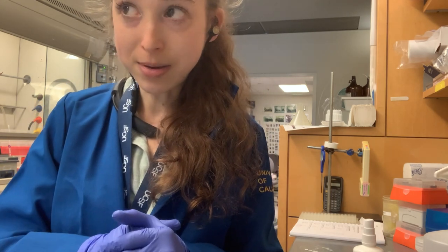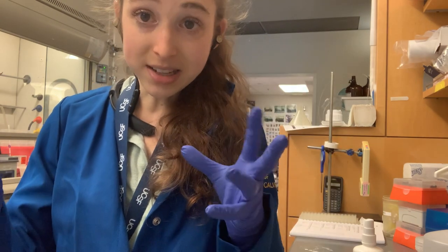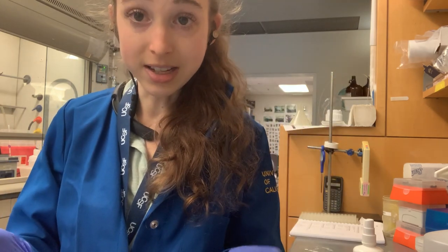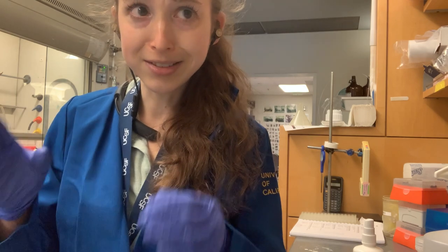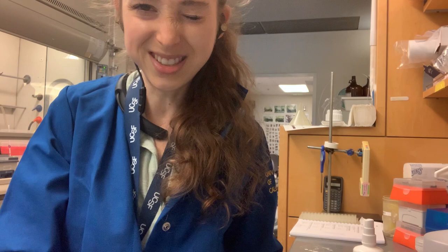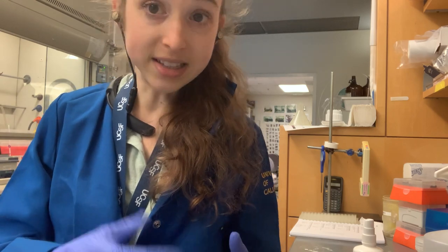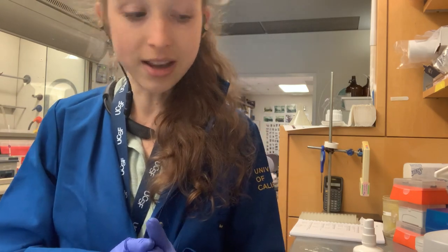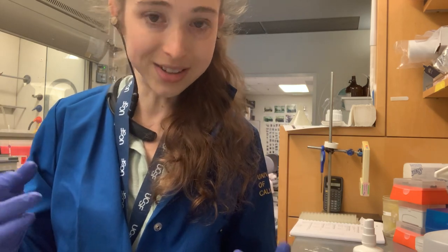Maybe you put your tubes in a heater block and then your colleague puts theirs in, and they're both labeled 1, 2, 3, 4, 5. Yeah, it's a mess. And sometimes you'll find tubes in the freezer labeled 1, 2, 3, 4, 5 and you have no idea what they are. So please use better labeling than that, unless you are literally standing and watching your samples and going to take them right away.